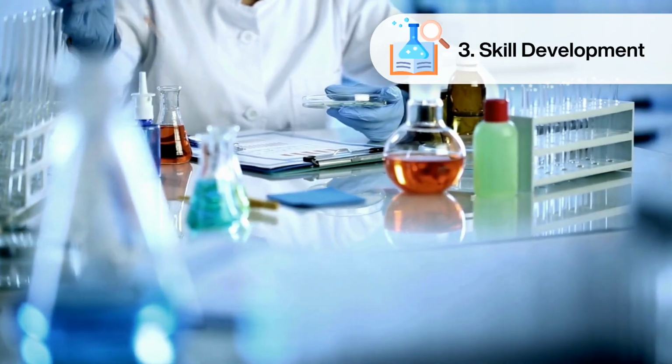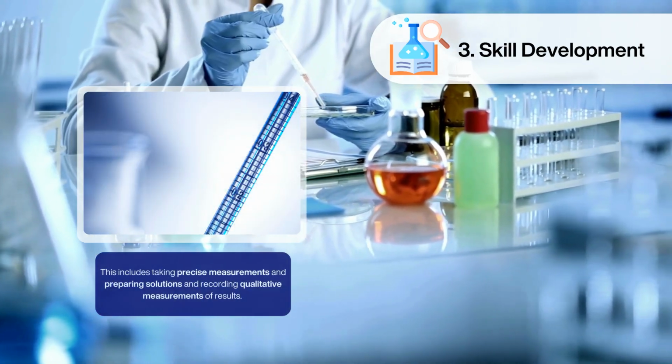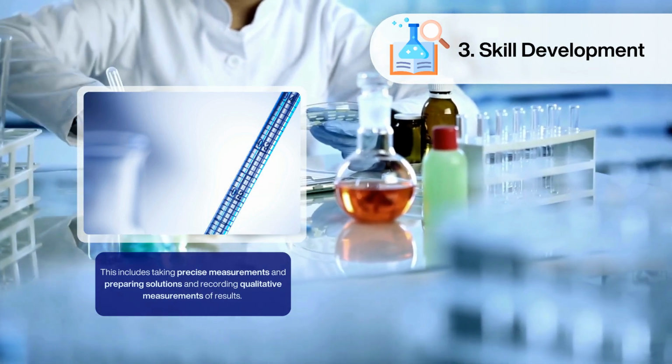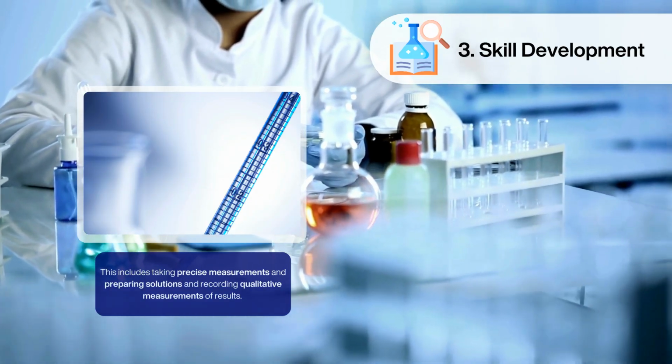Performing these tests will also improve essential laboratory skills. This includes taking precise measurements and preparing solutions and recording qualitative, descriptive measurements of results. These hands-on skills reinforce the importance of accuracy and proper technique in research.